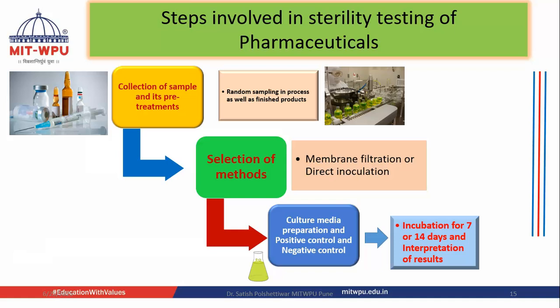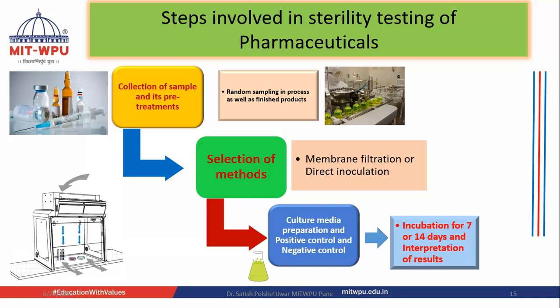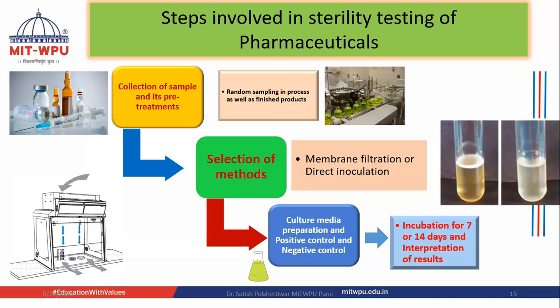If growth is detected, perform an investigation and identification of the microorganism that could indicate contamination during product testing. That is very important. We always need to ensure all of this. You can see the results. If your product remains clear throughout that incubation period, that is 14 days, then you can say the product is sterile. If turbidity is found, then you have to repeat that test and reconfirm. Repetition is very important because you have to ensure sterility as per the process.